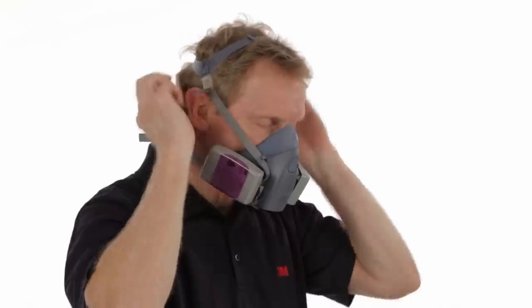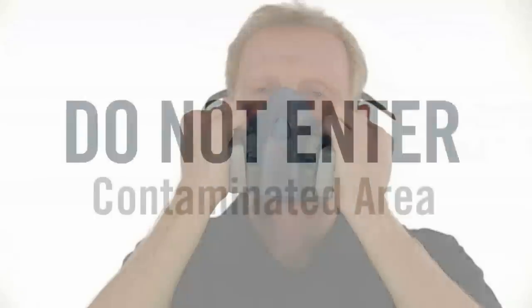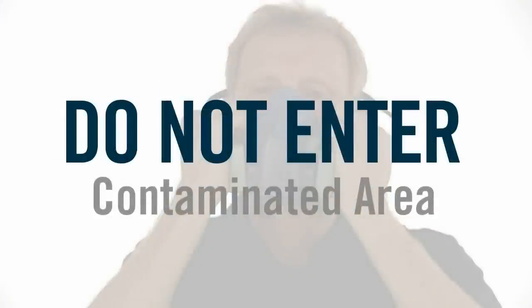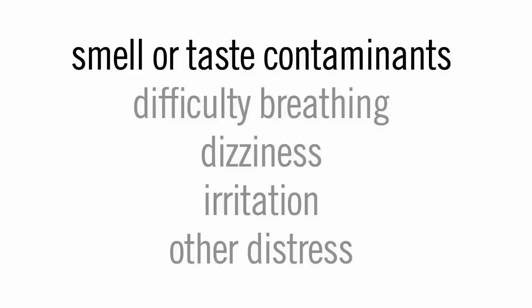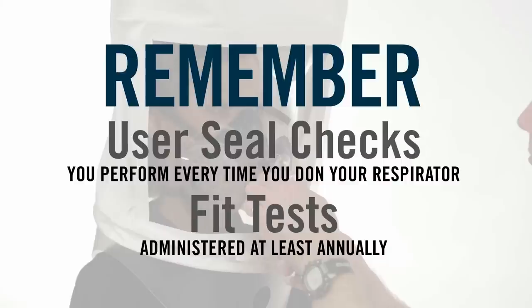If you have any difficulty getting the respirator to fit, review the user instructions in the packaging or the fitting instructions provided by 3M to be sure you are putting it on correctly. If your respirator still doesn't fit correctly, see your supervisor. A user seal check must be performed every time you put on your respirator. Never enter a contaminated area if your respirator does not seal properly. It's very important that you have a fit test to be sure the respirator is capable of fitting you properly. Your respirator may be damaged if you smell or taste contaminants, if breathing becomes difficult, or if dizziness, irritation, or other distress occurs — leave the contaminated area immediately, see your supervisor, and repair or replace your respirator. Remember, a user seal check is not a substitute for a fit test. It is very important that you are fit tested annually.